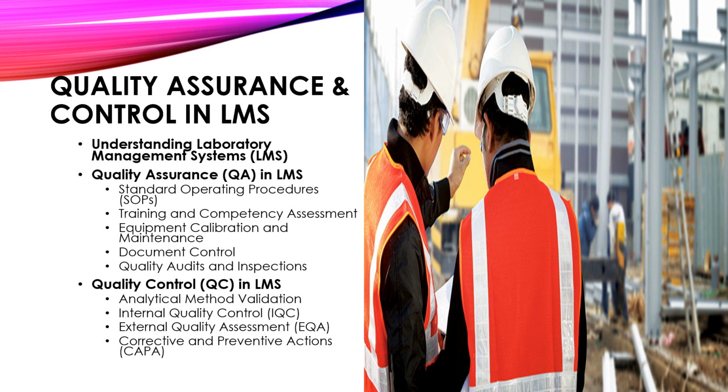Training and competence assessment. Continuous training programs to equip laboratory personnel with the necessary skills and knowledge to perform their tasks accurately is key, very important. Competency assessments help identify areas for improvement and ensure that staff members are proficient in their respective roles.